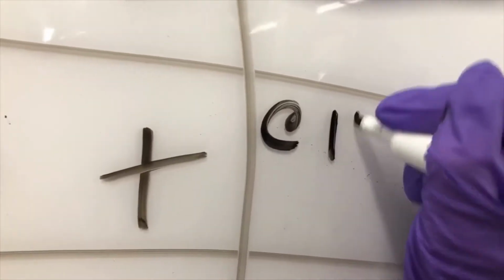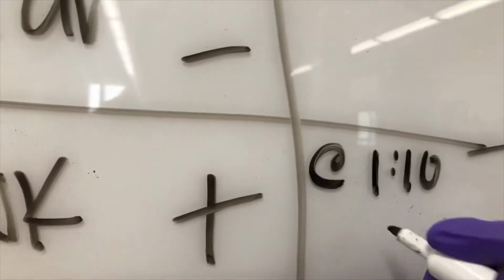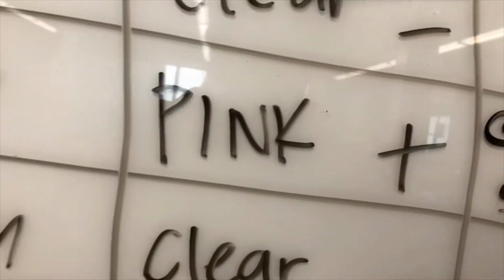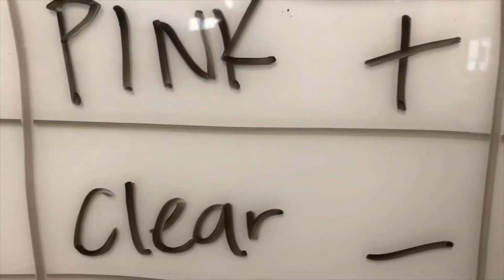So spectra, oh nope, not that guy. This is for the copper. So at 1:10, there was an absorbance at 501.2, I think. I will go double check that.